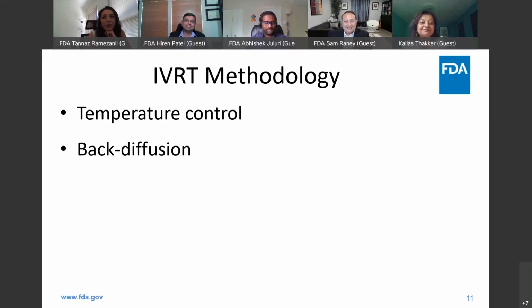Okay, our next topic is related to stirring rate, and this is something that we ask in the topical cream guidance to be qualified. There are cases when the apparatus only operates at a fixed stirring rate.